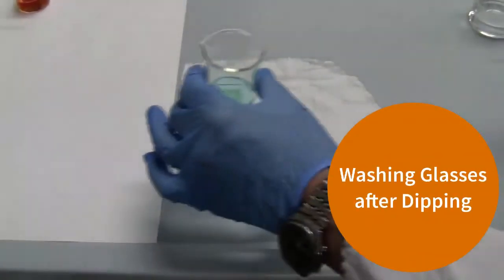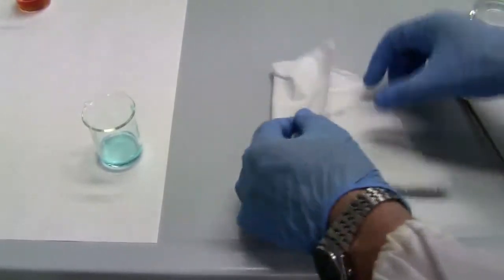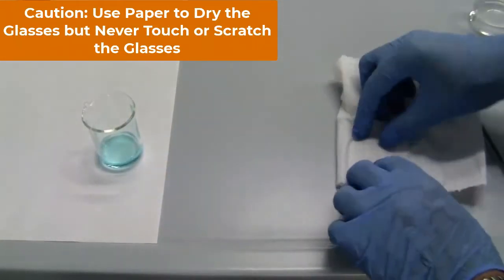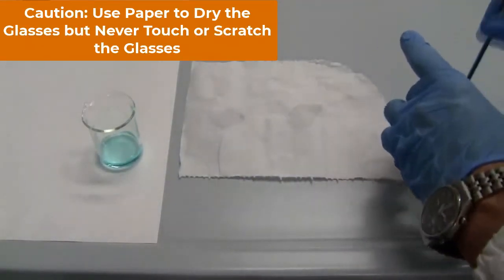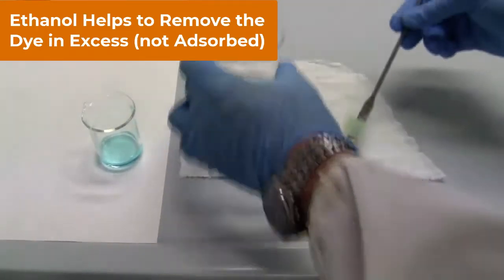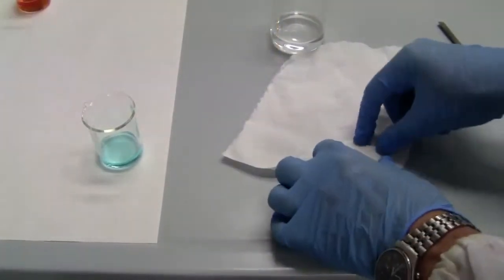The glass is extracted from the beaker with the help of a spatula and deposited onto a piece of paper. The liquid is eliminated by using the paper but never touching the glass to avoid scratching the titania. After a few times, more or less our glass is nearly dried, and after it can be put into a beaker containing simply ethanol and also washed, and the drying is repeated again.